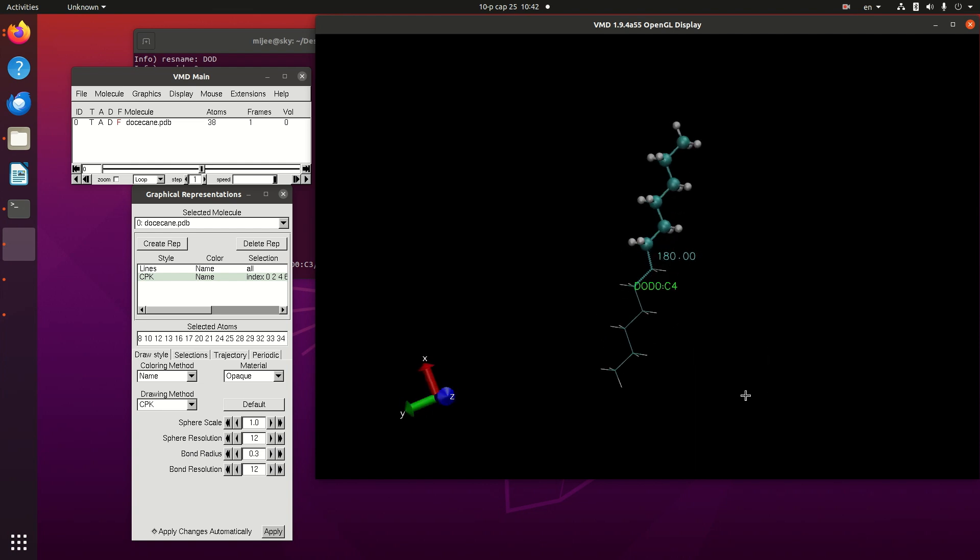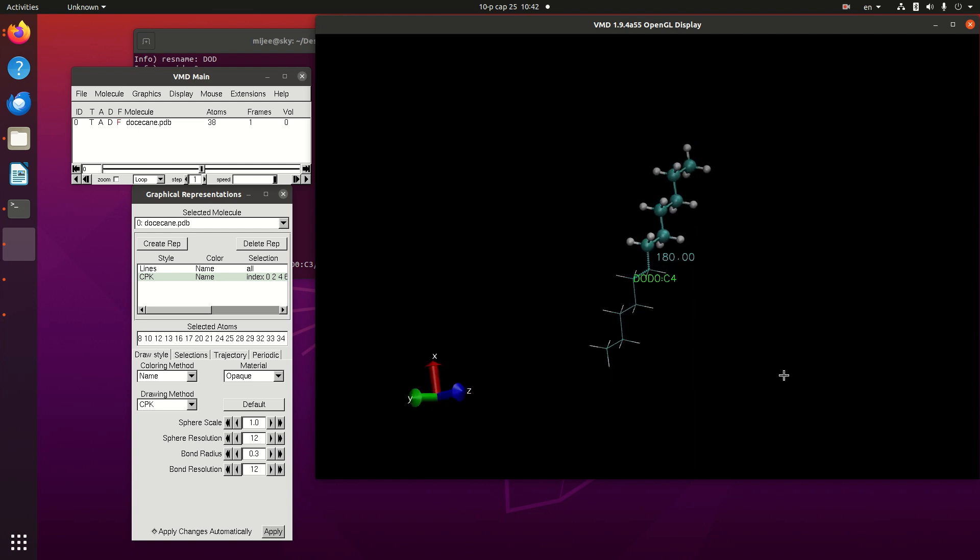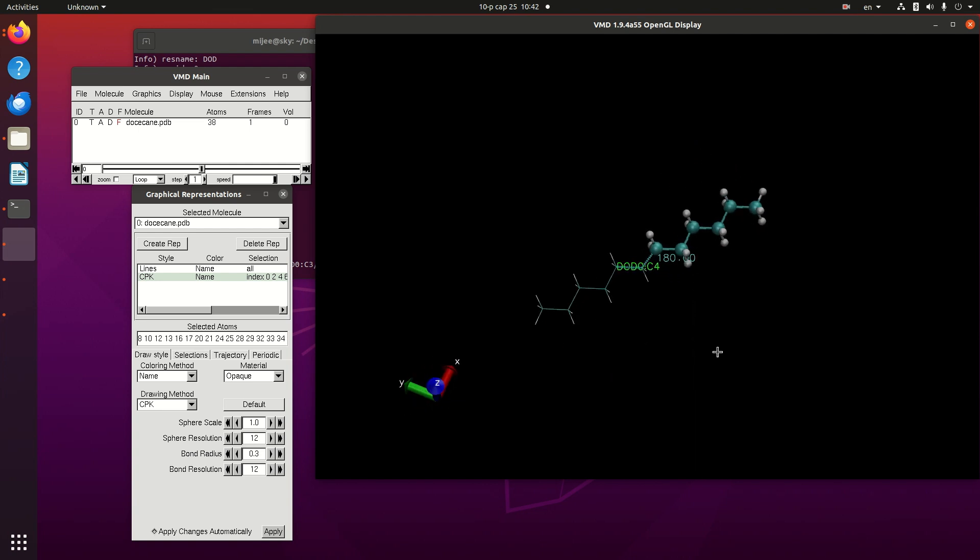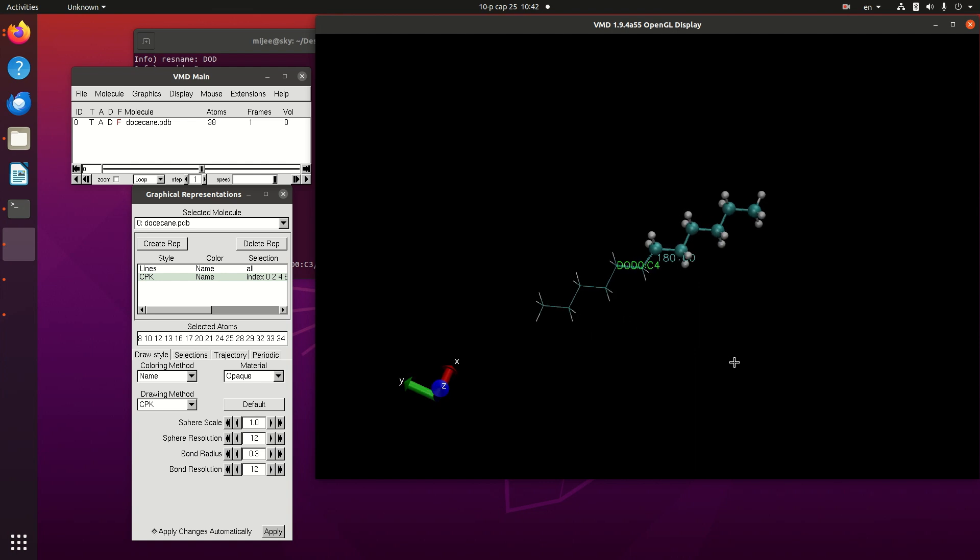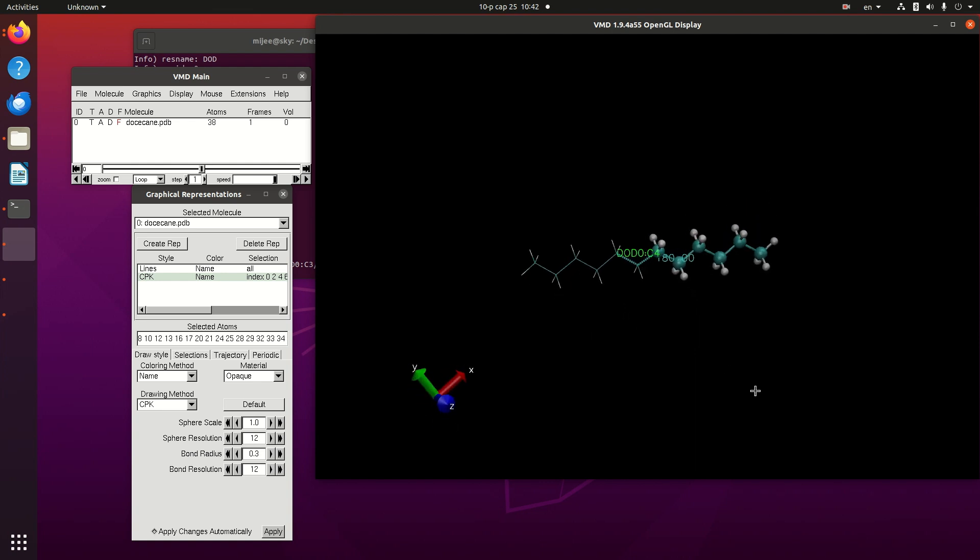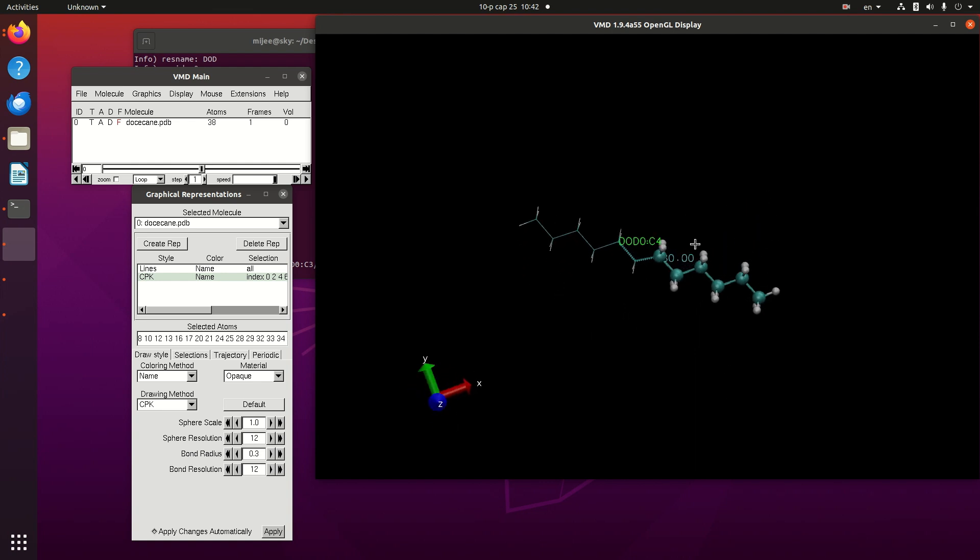Okay, in order to do this, I want to rotate the representation. We should select this different representation and also we should select the rotating atom. Click with the shift button and move representation.